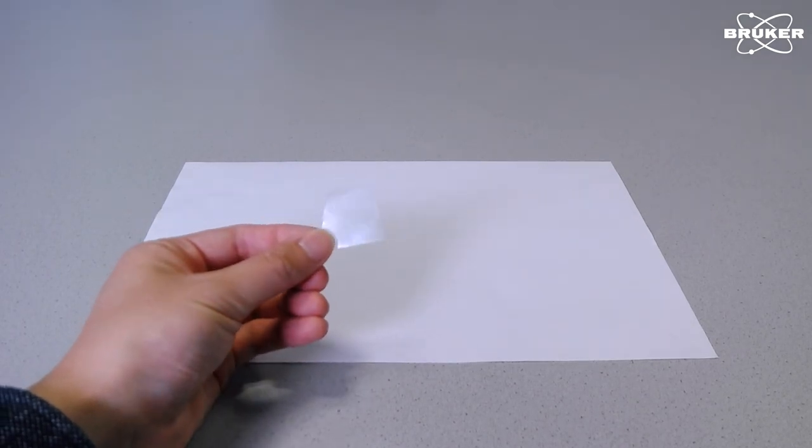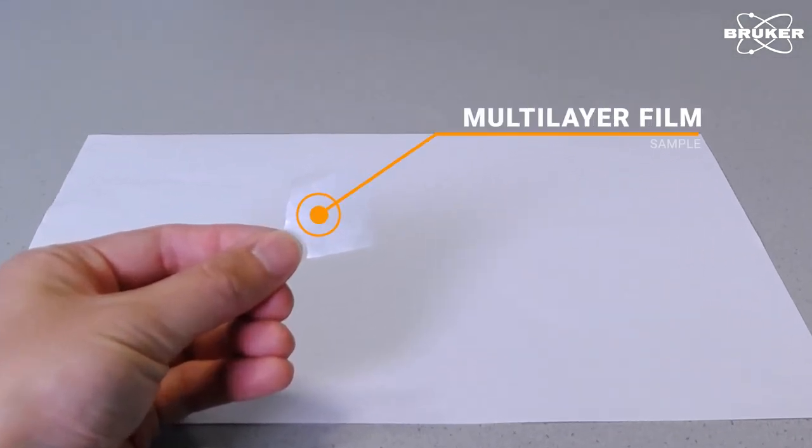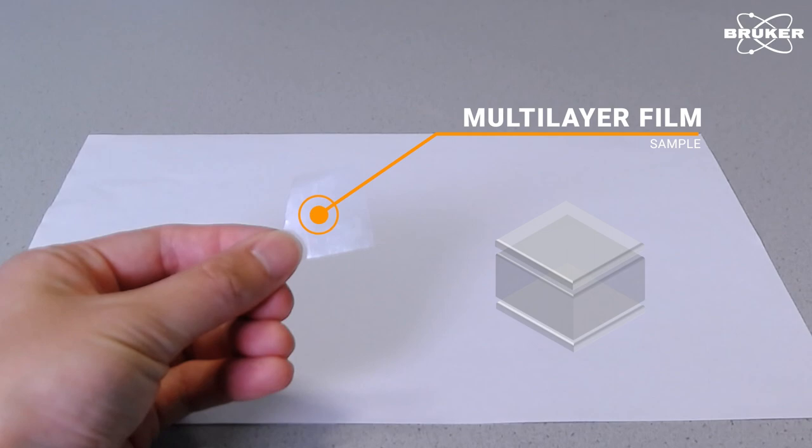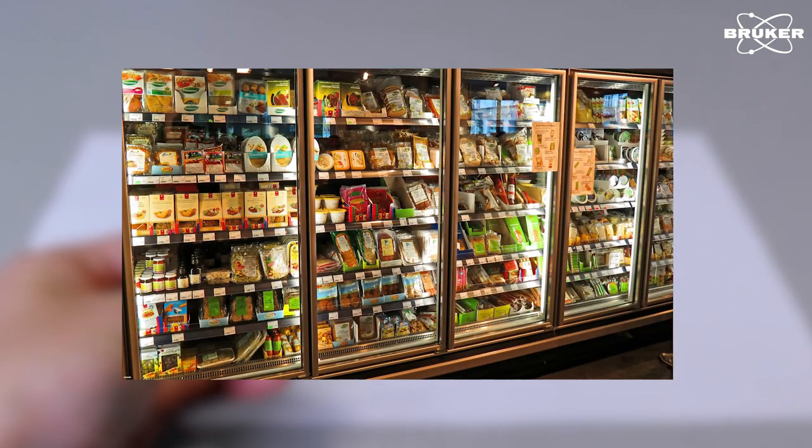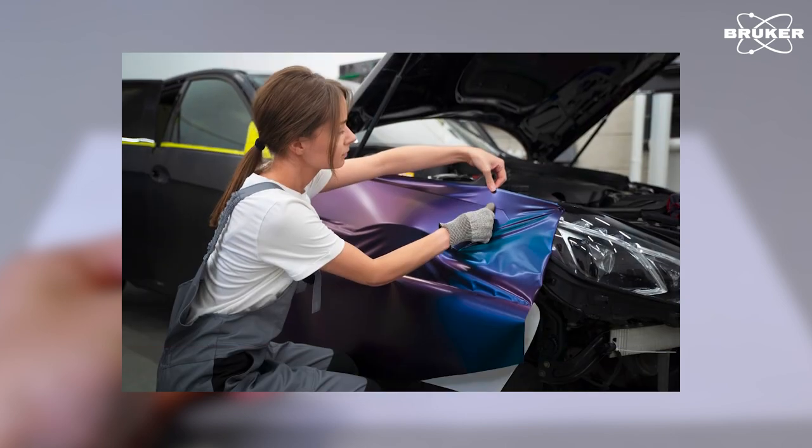Multilayer polymer films and laminates like this sample are a key part of modern and effective packaging. They protect food from oxygen and moisture, surfaces from UV radiation, or car paint from scratches and other superficial damages.